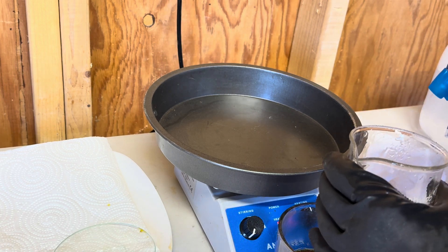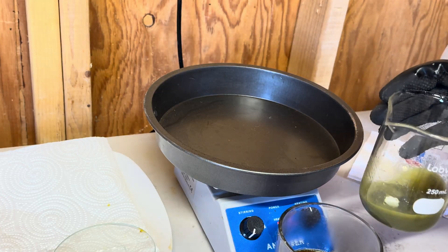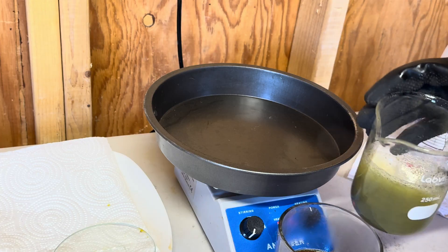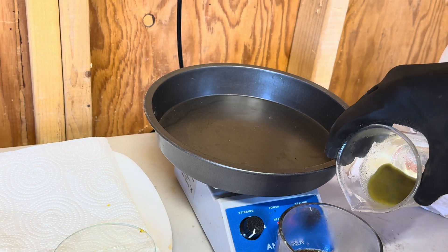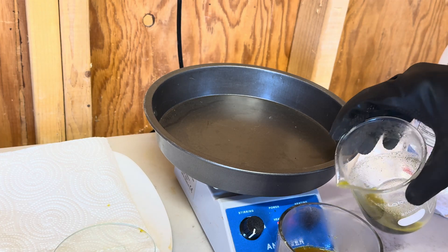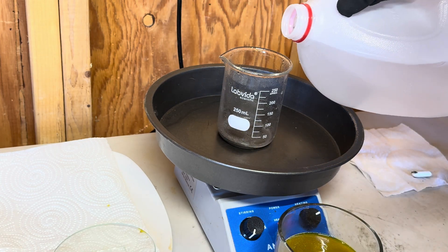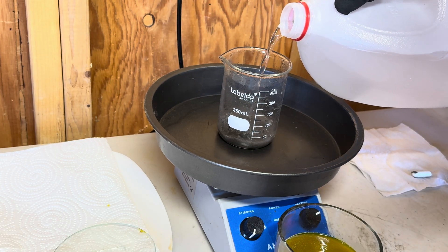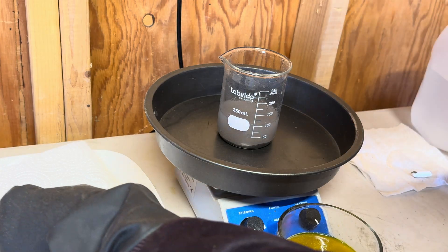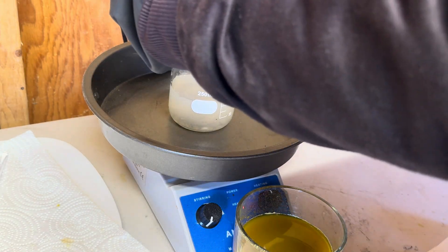Let's begin the rinsing process — we're going to add in some distilled water and bring it to a boil to clean out this material. We're going to do that twice, and then we will add in some more hydrochloric acid and perform a second wash. In this video I'm only going to show you the first rinse, not the second, because it gets redundant, but we did do two rinses before we added hydrochloric acid.